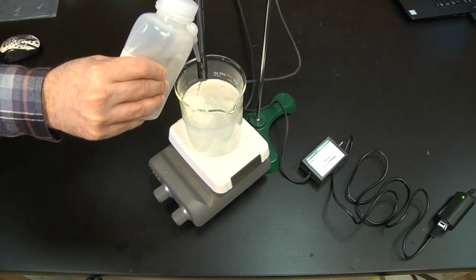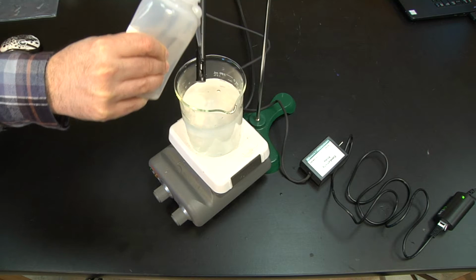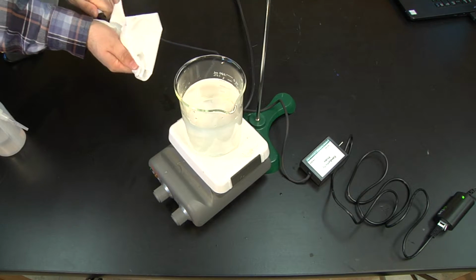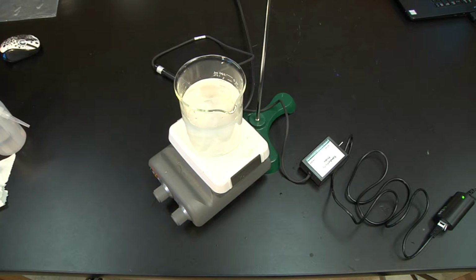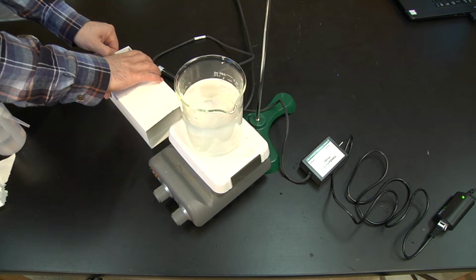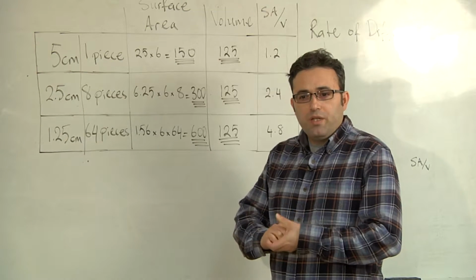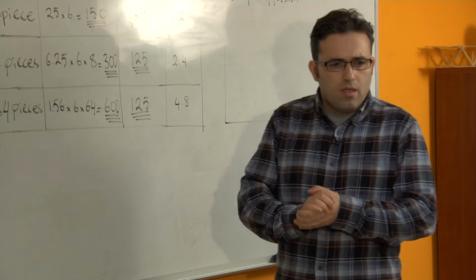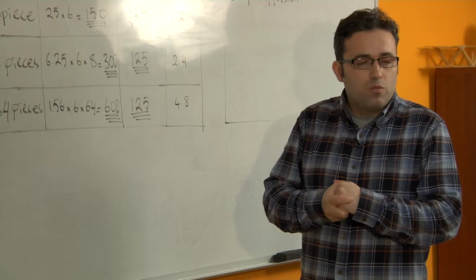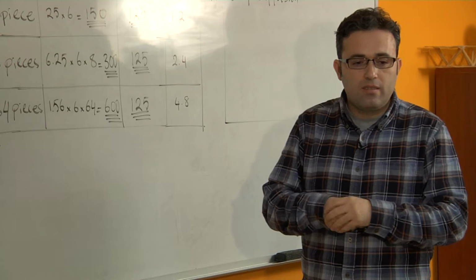You thoroughly clean your conductivity sensor using distilled water. Blot it dry using a piece of paper towel and store it in its box for longer use. As seen in the graph generated by the software, trends are pretty clear. But in order to make a clearer picture of the results, it is necessary to further process the data collected.